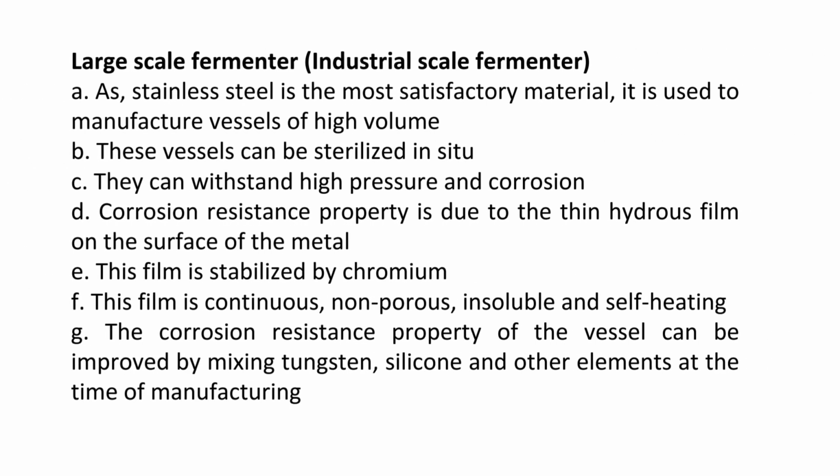Large-scale industrial fermenters are made of stainless steel, which is the most satisfactory material. These vessels can be sterilized in place, SIP, withstand high pressure and corrosion.